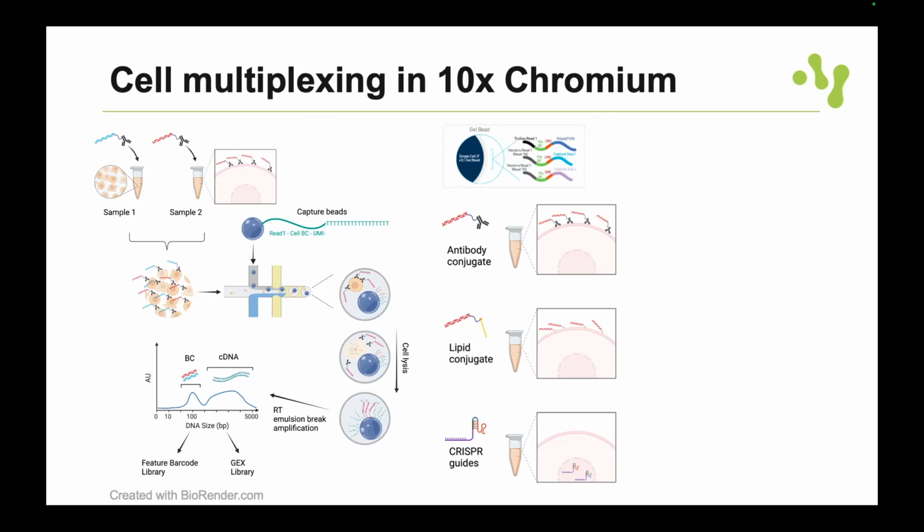I'm not sure how efficient all of these tools are, because if you have two cells of the same cell type, it's not so trivial to decide if it's a doublet or not. My experience is also this: these companies want to sell their kits saying we have a high capacity, but maybe they are pushing it so the PI says, "Oh, it's not too expensive."